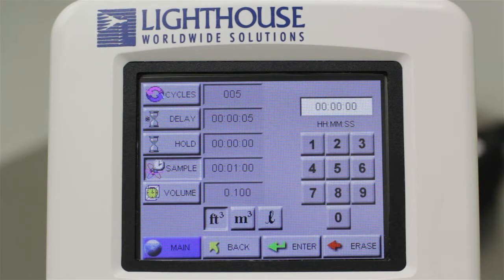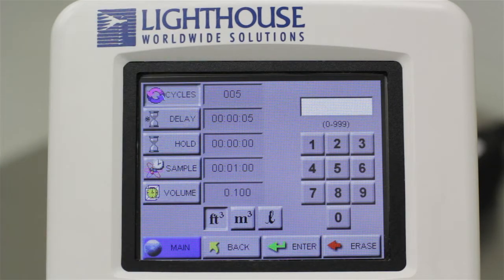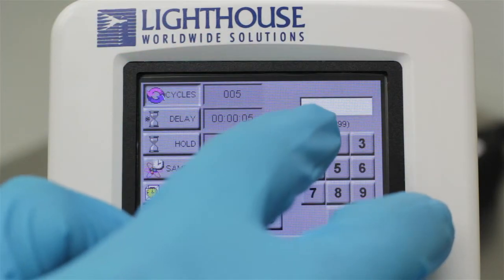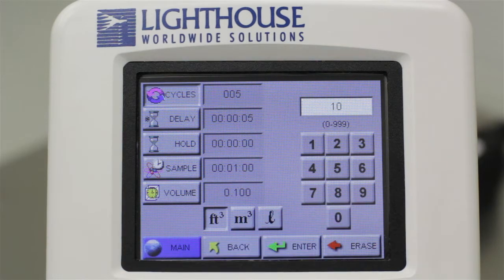Starting at the top of the menu, the Cycles button tells the particle counter how many samples or cycles to take before stopping. To change the value, touch the button labeled Cycles, then use the numeric keypad to the right to enter the desired number of samples. In order for the new value to be recognized, you must press the Enter button at the bottom of the screen.